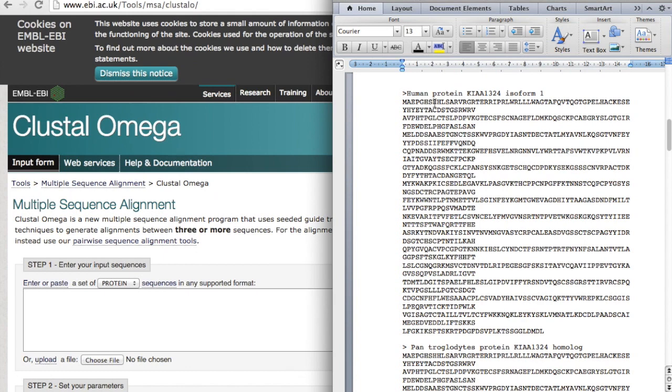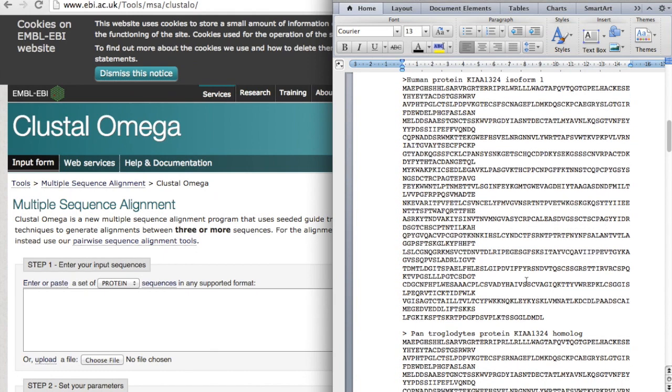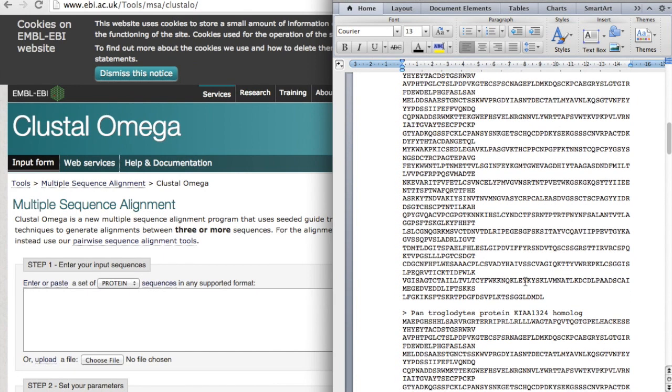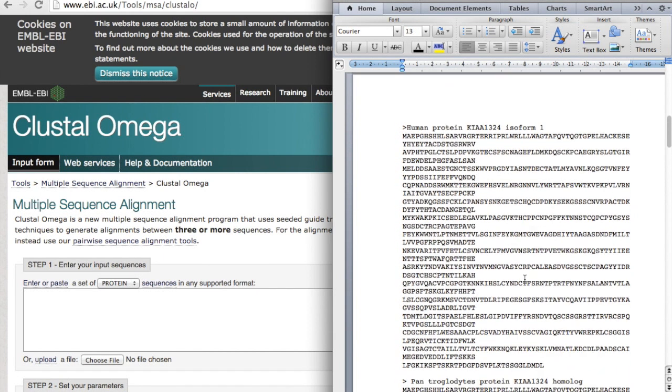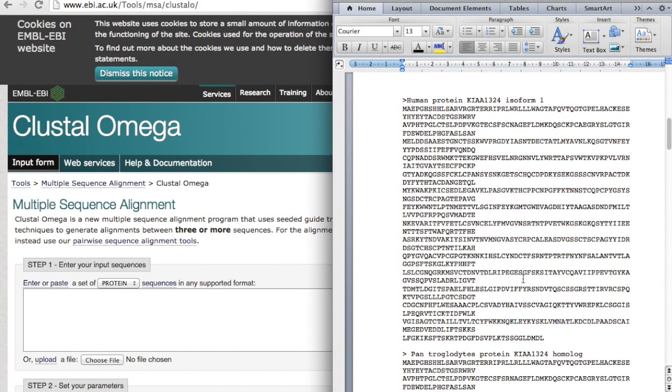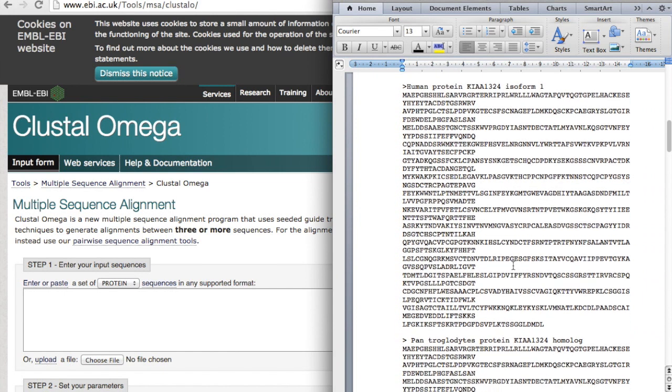And here are the FASTA sequences. And then what we will do is to copy paste them in Clustal Omega. You can find Clustal Omega via Google. Just type Clustal Omega and it will lead you to this site.